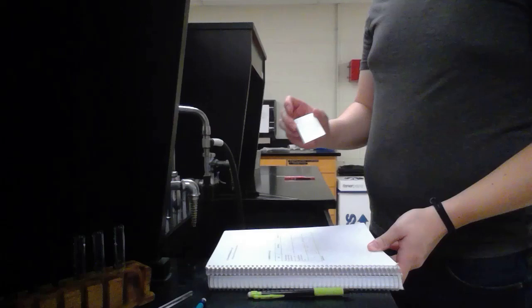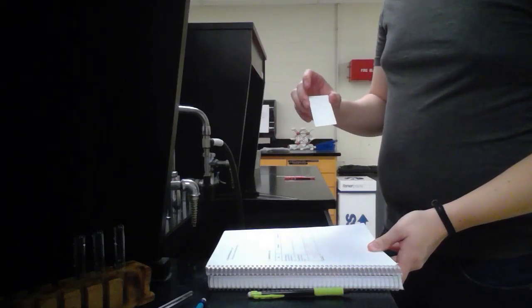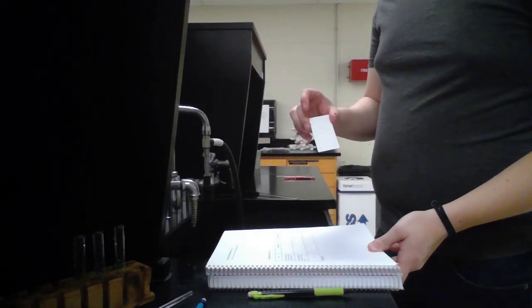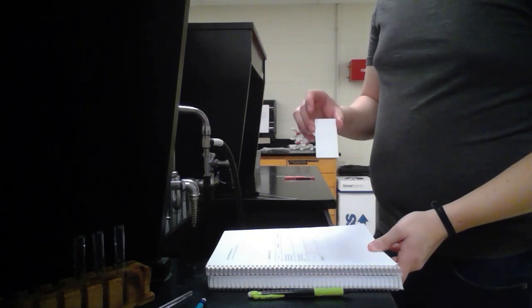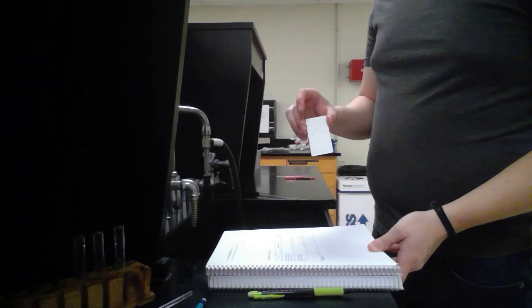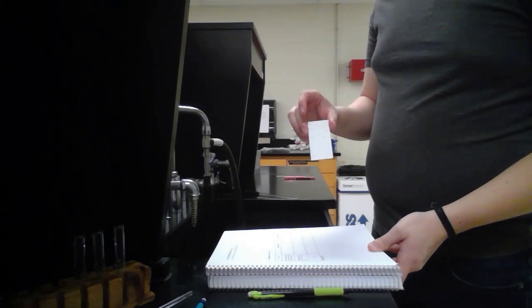The values for the distance that the substance has traveled: aspirin moved 32 millimeters, our made aspirin moved 33 millimeters, salicylic acid moved 41 millimeters, and the solvent distance was 51 millimeters.